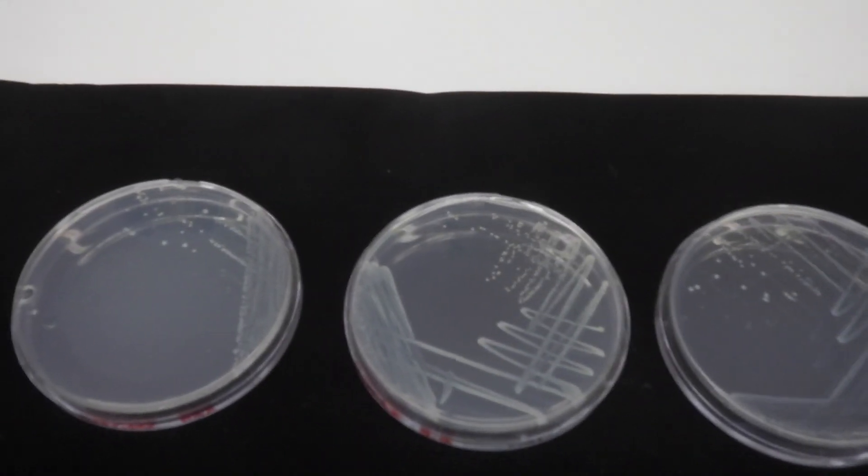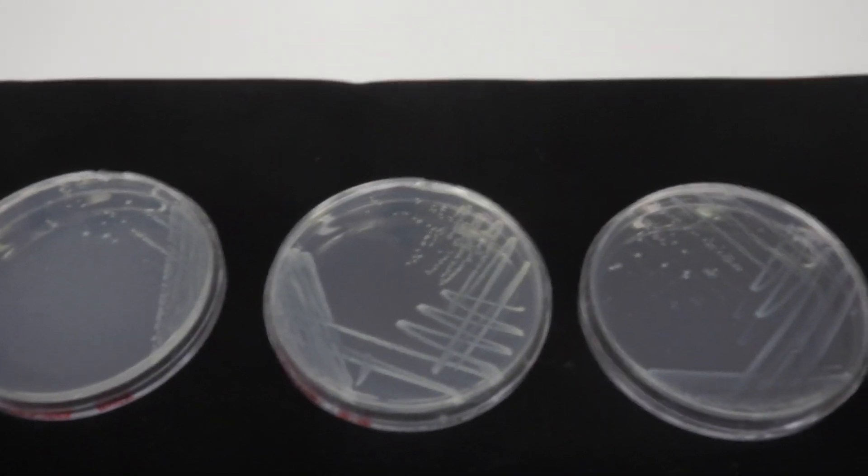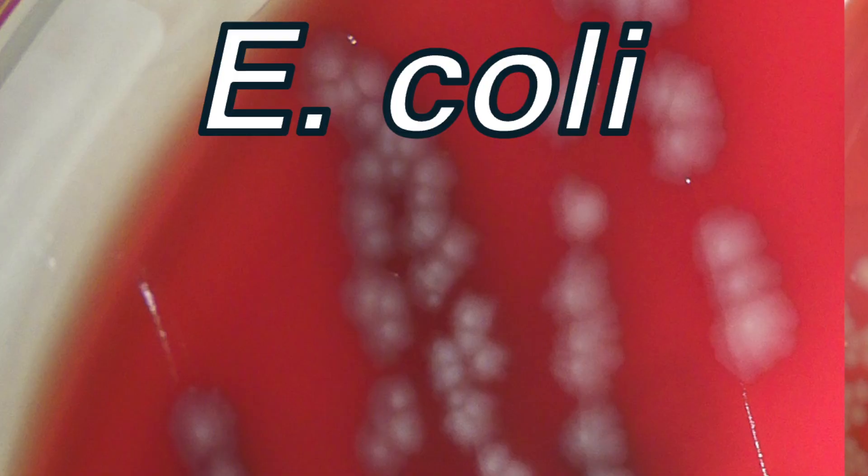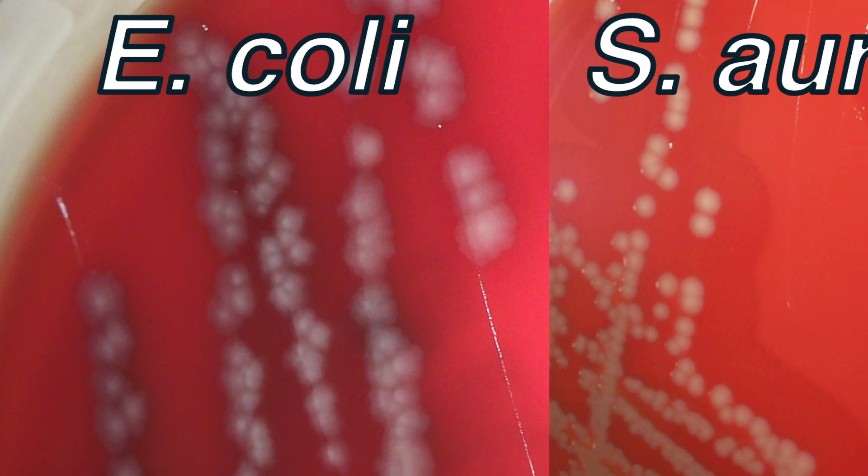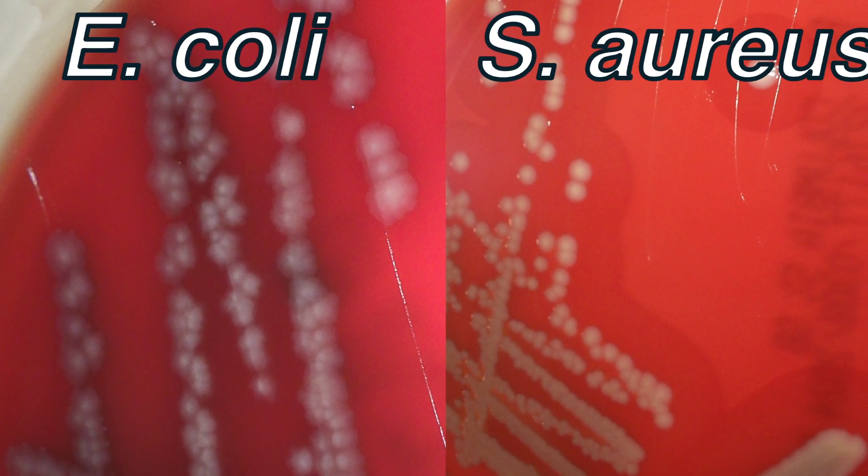What I hope you can appreciate here is that the colony morphologies are not distinct enough to readily differentiate them from each other on the mixed plate. This really highlights the importance of using a media where different bacterial species can be readily differentiated like blood agar.